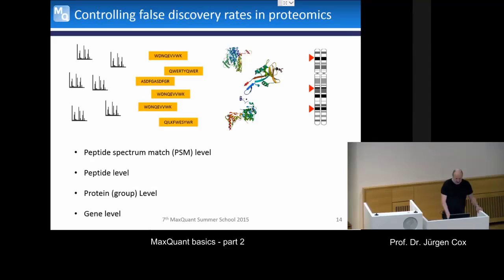So once we have calculated these, and this is something you do on the peptide spectrum match level, on the PSM level, we can now easily calculate or enforce the false discovery rate, or calculate the Q value, so this is all equivalent, on the PSM level, right? Because we then just take this posterior error probability as the thing that we sort the table of PSMs by, and then if you want to have 1% FDR there, you just cut the table off when you have 1% reverse hits, basically.